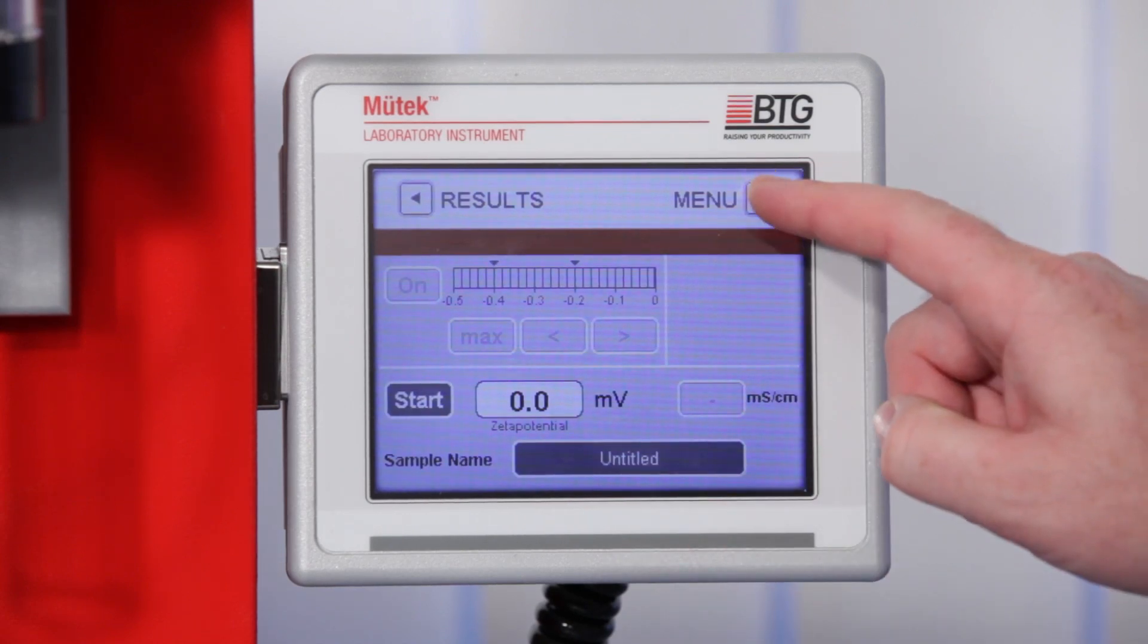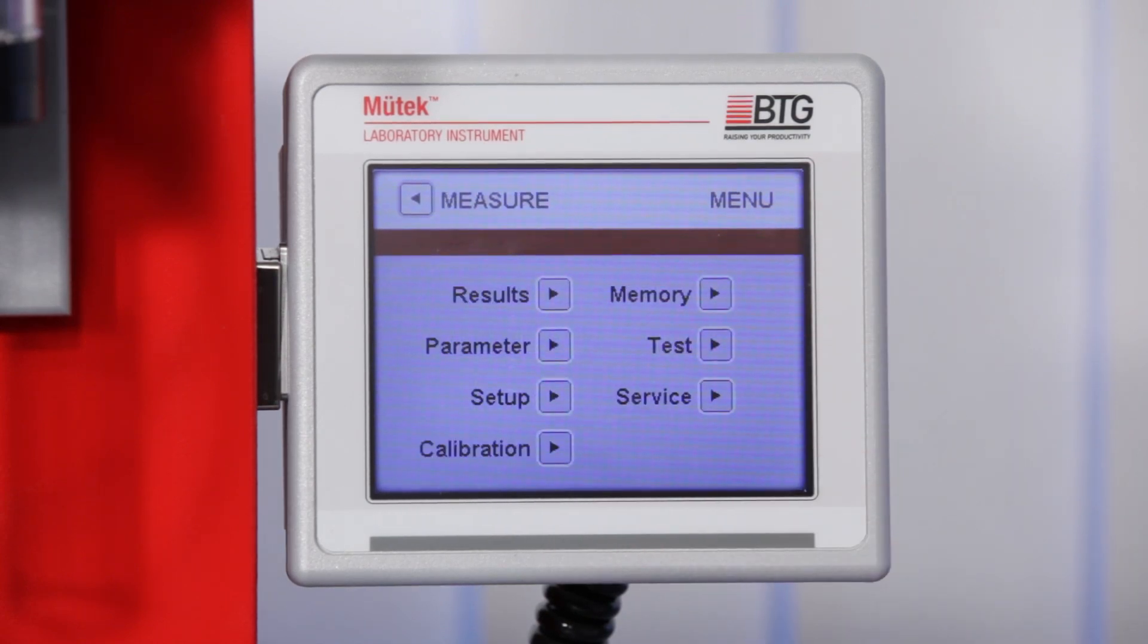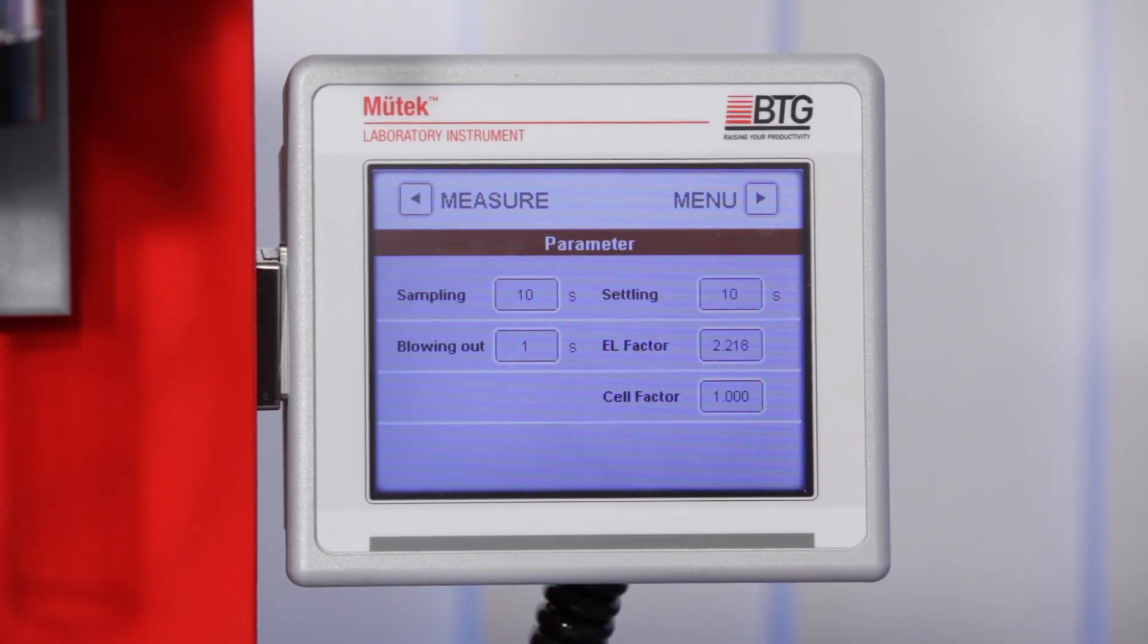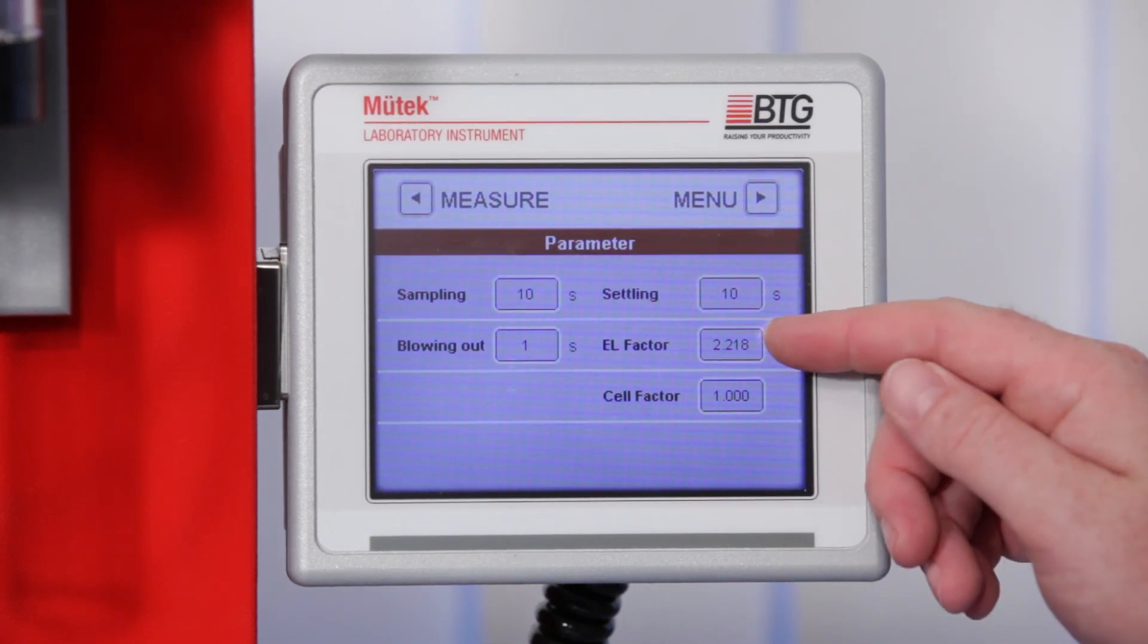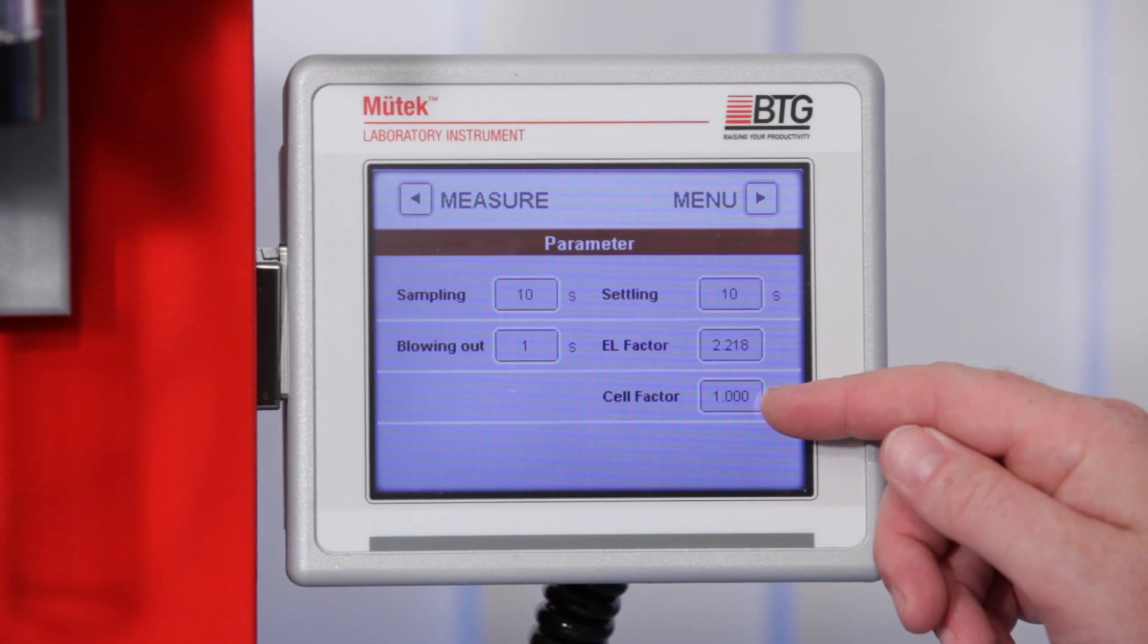Press the Menu button if special adjustments for the upcoming measurements are necessary. Under Parameters, you can view or change the time sequence settings of a measurement, as well as the calibration factors for measuring conductivity and streaming potential.